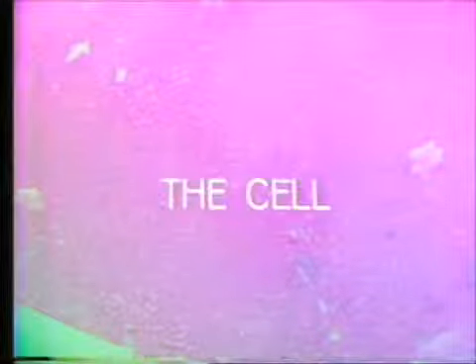The first in our television demonstrations on histological and microscopic structures concerns the cell. The cell has two major components, the nucleus and cytoplasm. You are viewing a low-power view of a section of liver stained with hematoxylin and eosin, a red and blue stain. Now we'll move to a higher power and you'll see the cell detail more clearly.